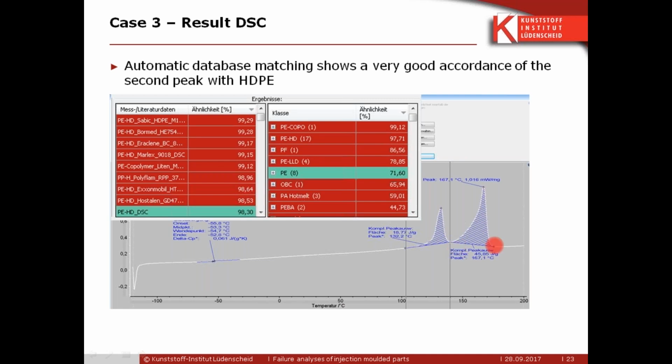I don't know if some of you are familiar with the NETZSCH polymer poster. All the ones that are on there would be in green, and the 600 ones from Martin Doth from Kunststoffinstitut Lüdenscheid would appear in red. But there's a lot more information on these.